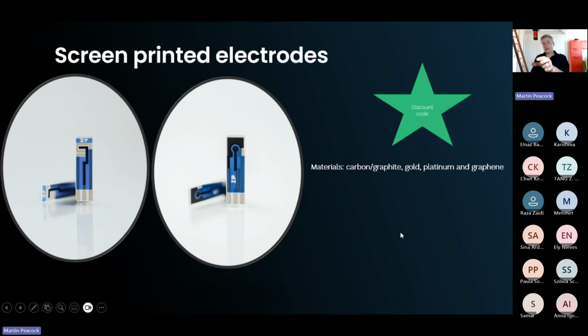I'm a little bit softer on platinum because I understand that platinum actually has some catalytic properties. So, for example, if you're making an enzyme sensor for glucose, lactate, or alcohol, many of them are oxidases, and oxidases produce hydrogen peroxide.